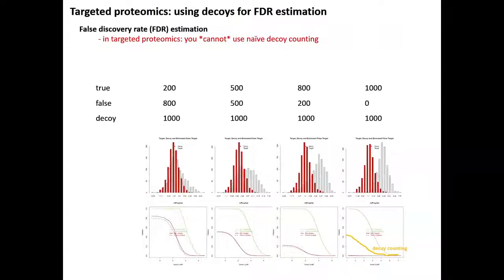If you have now 50-50, basically the distributions equalize each other. If you reverse, you have 80% human peptides, you have a stronger component here, and 20% E. coli, a smaller component here. And if you have 100% human peptides, you get basically only the hopefully true peptide identifications. So the point I want to make here is that even if you get 100% of true peptides that should be present in your samples, you see that actually the separation between the targets and the decoys is not perfect.